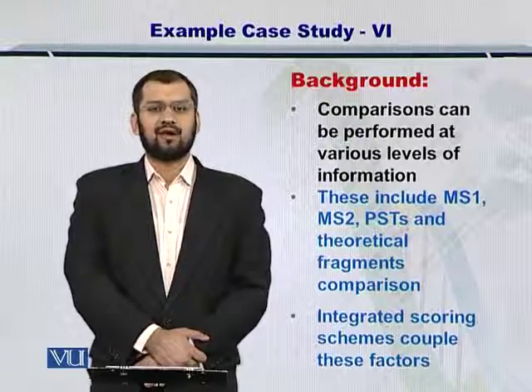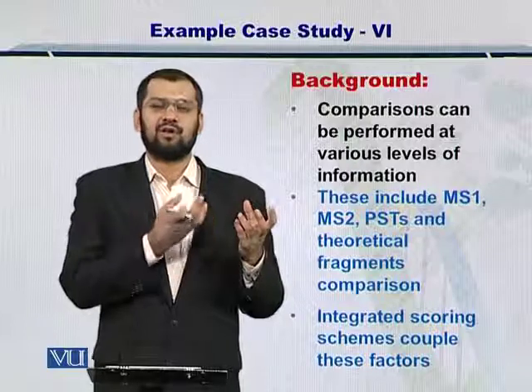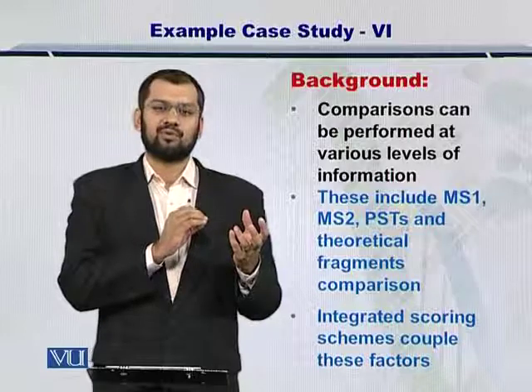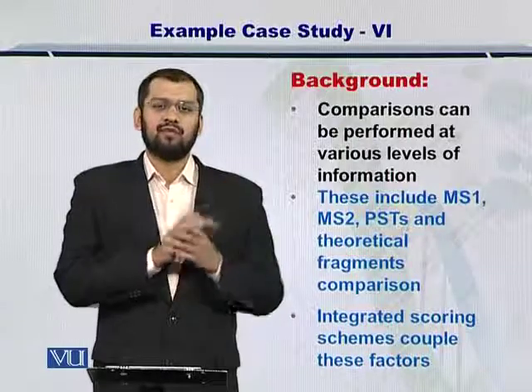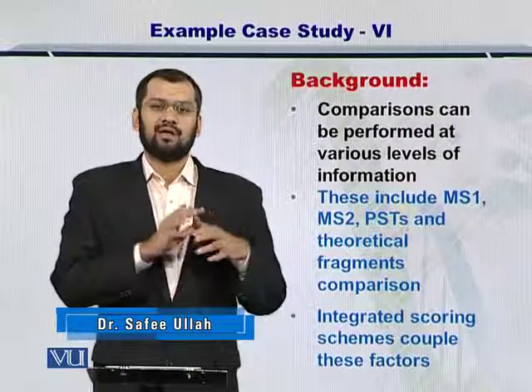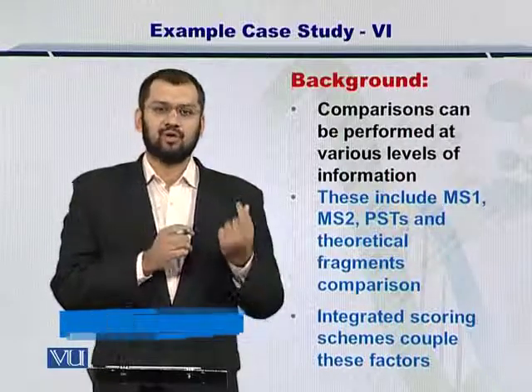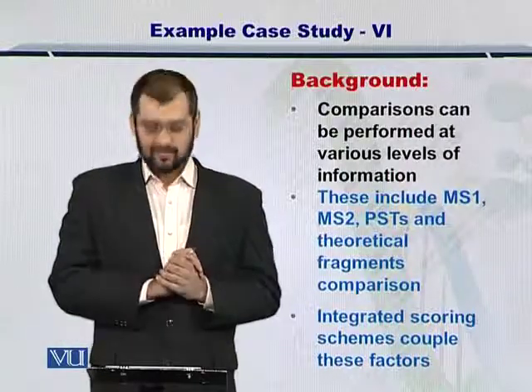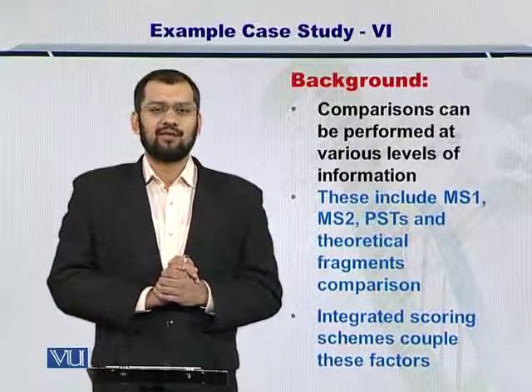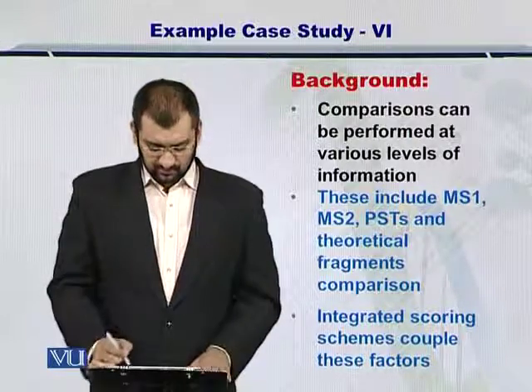So the data that we have now is the MS1 data, the MS2 data, and the in silico spectrum that we generated from the candidate proteins coming in from the protein sequence database. It would be really nice if the scores that were obtained for each one of them is integrated into a single system so that we can have a quantitative quality measure on the candidate proteins. So the integrated scoring schemes, they couple these factors together, and we will see how these work for the case study.